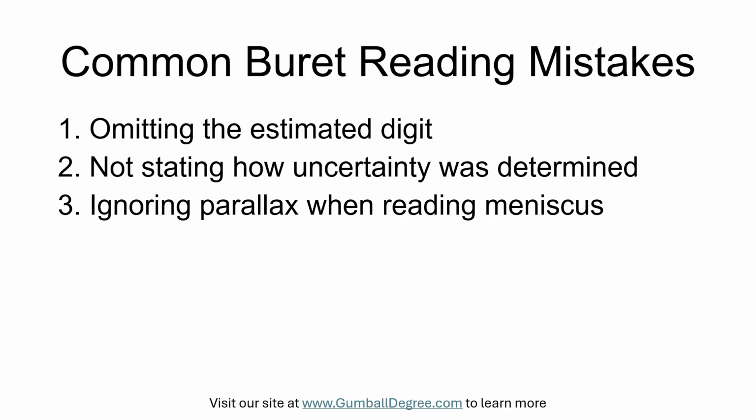Another common mistake is ignoring parallax by not aligning the eye with the meniscus, which shifts the reading. Fix this by bringing your eye level with the bottom of the meniscus before recording the volume.